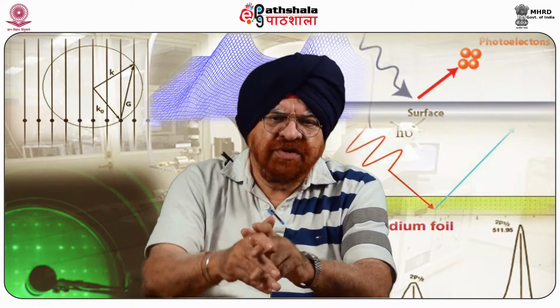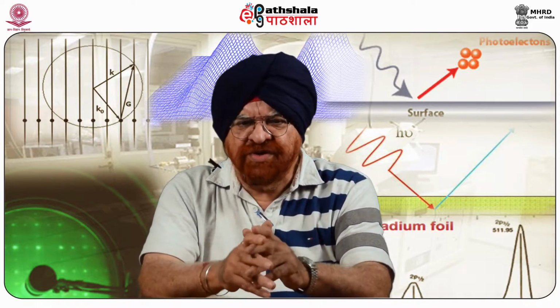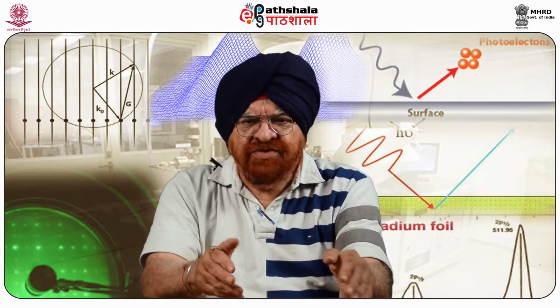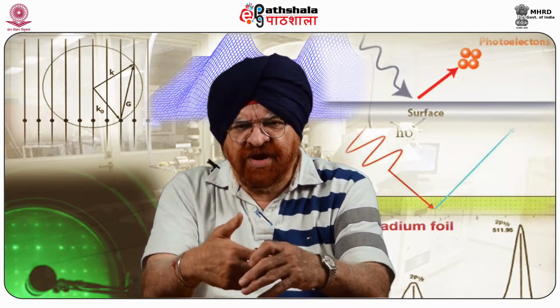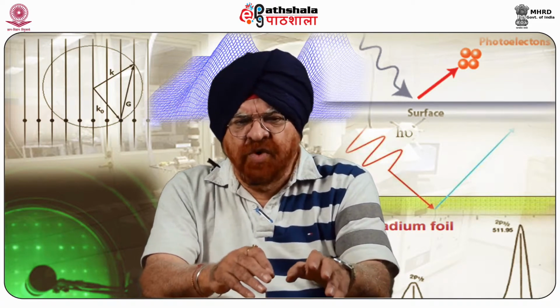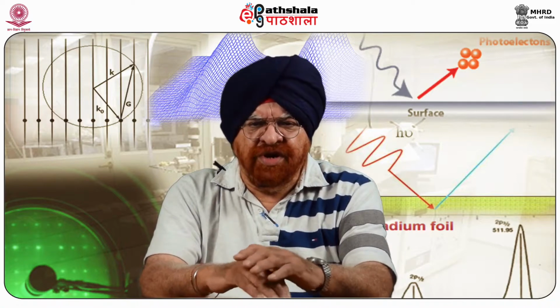High resolution and high sensitivity. Normally, when the resolution becomes extremely high, the sensitivity goes down, and vice versa. If the sensitivity is very high, then the resolution goes down. So having both of these is not very easy to find in a particular technique.